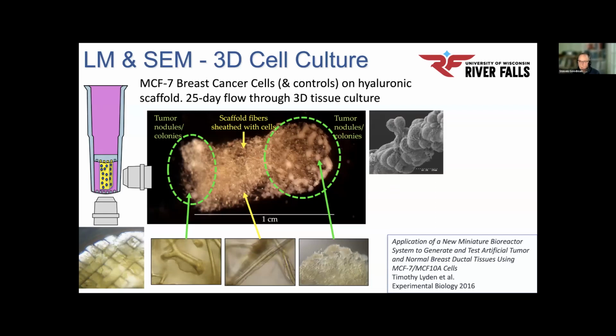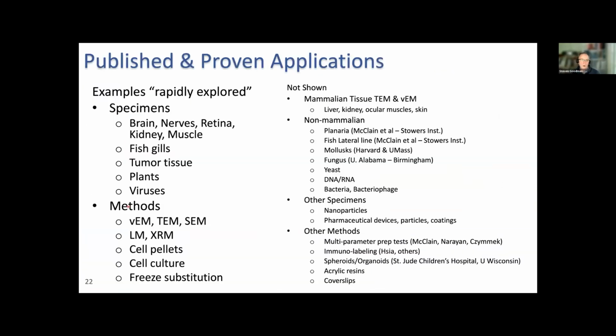These can then be prepared for SEM. So one can do a correlative approach in the SEM. And one can also collect the cells that come out through the capsule and run flow cytometry and do some analysis on the cells there. And in this particular case, the breast cancer cell scaffolds had a cancer-like phenotype, but I'm not showing all the data from this. So that kind of shows a breadth of ranges.